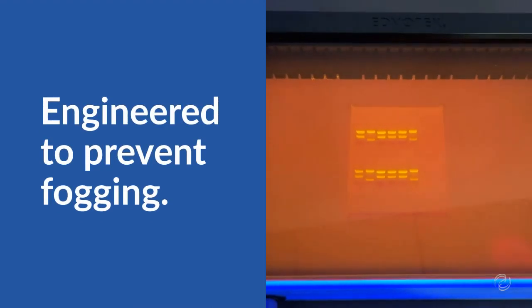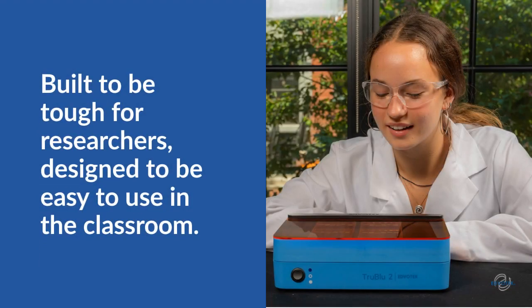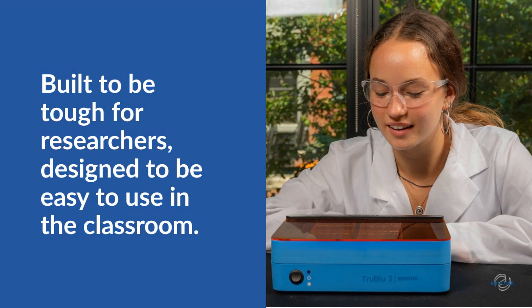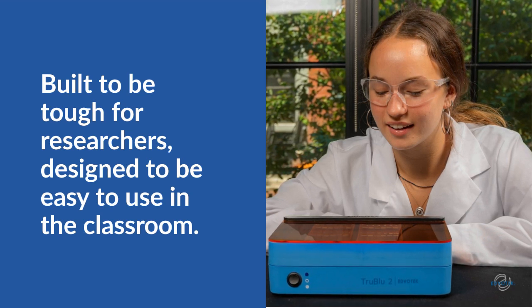The high-powered fan and extensive ventilation system prevents condensation on the orange filter. This transilluminator is tough enough to stand up to daily use in the research laboratory, but with features that make it easy to use in the classroom. Its compact and lightweight design also makes it easy to move and set up, allowing for quick and efficient use anywhere in the lab.